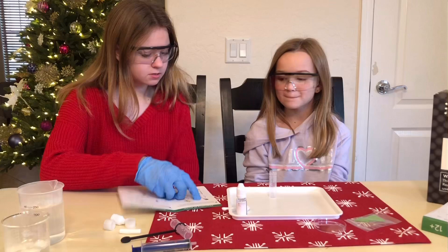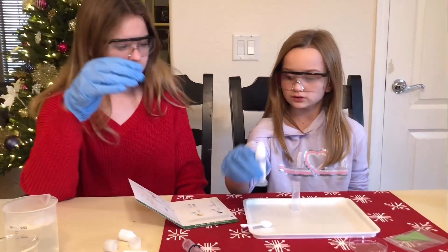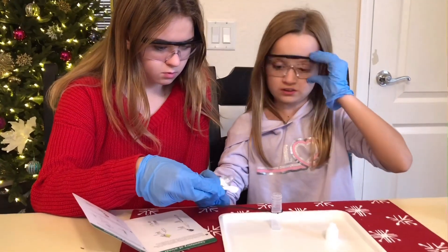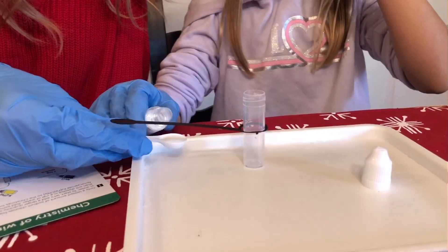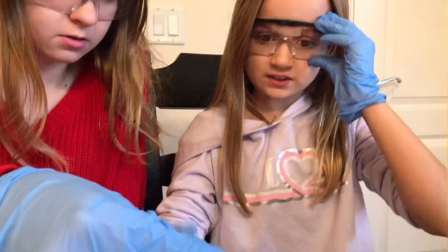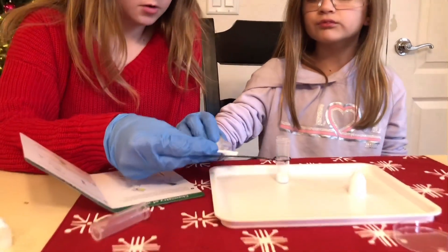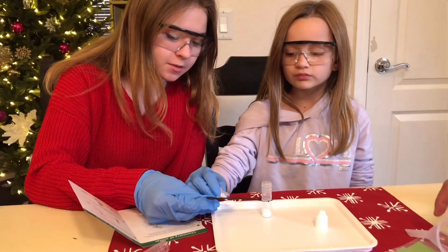Alright, NaCl, NaCl, NaCl. Can you put some of that in? We're gonna use two big spoons. Pour it in here. That's good, a little bit more. Perfect. Pour it in. One more. Make sure you guys check the link in our description to get your very own Mel Chemistry set.